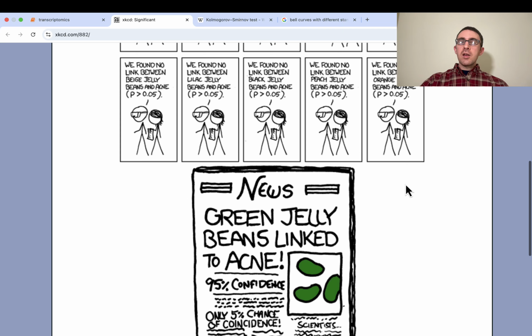So it seems like both of these example genes have a change in mean expression between the conditions that has basically the same effect size, right? Because in both, one condition has twice the mean expression of the other. In example gene 1, IPF has twice the mean of control, and in example gene 2, control has twice the mean of IPF.